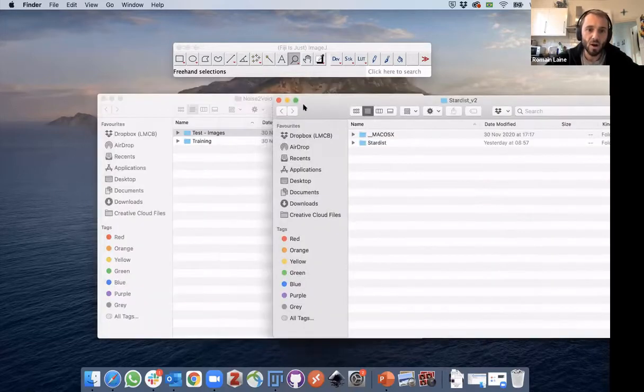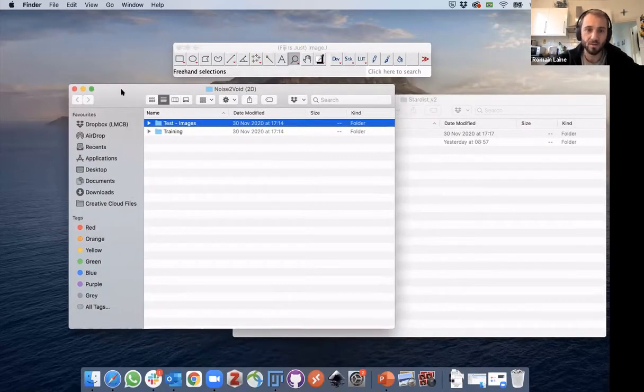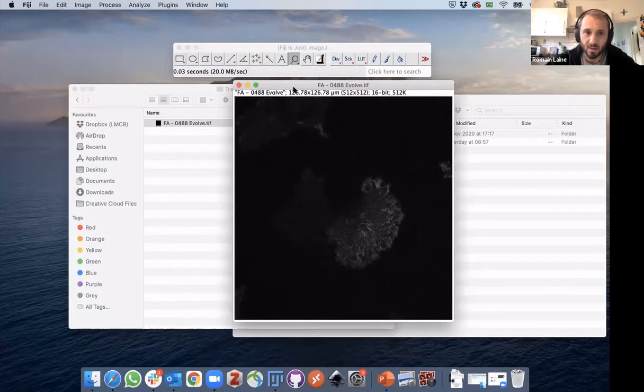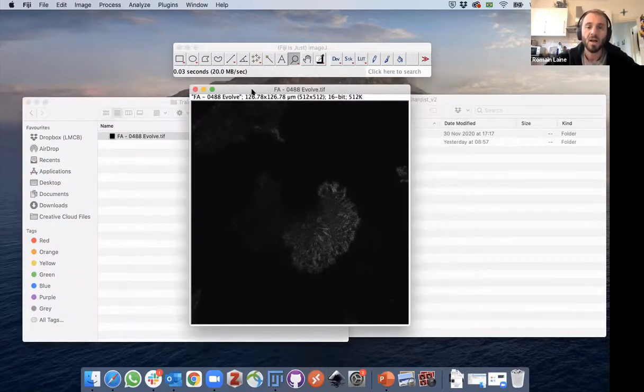In the case of Noise2Void, and that's why we wanted to show this to you, it uses a learning method which is called self-supervised, or sometimes you hear the term unsupervised mode, because it can learn the target directly from the data itself. So it doesn't need the equivalent denoised image, okay?